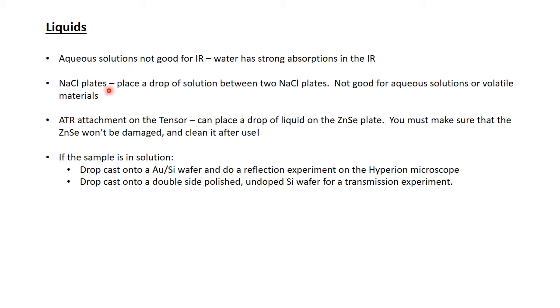Another option, which I have not used very much, is to use some sodium chloride plates. Essentially, you place a drop of your solution between these two very flat sodium chloride plates, and it creates just a very thin film of your solution or your liquid sample. And we do a simple transmission experiment through that.